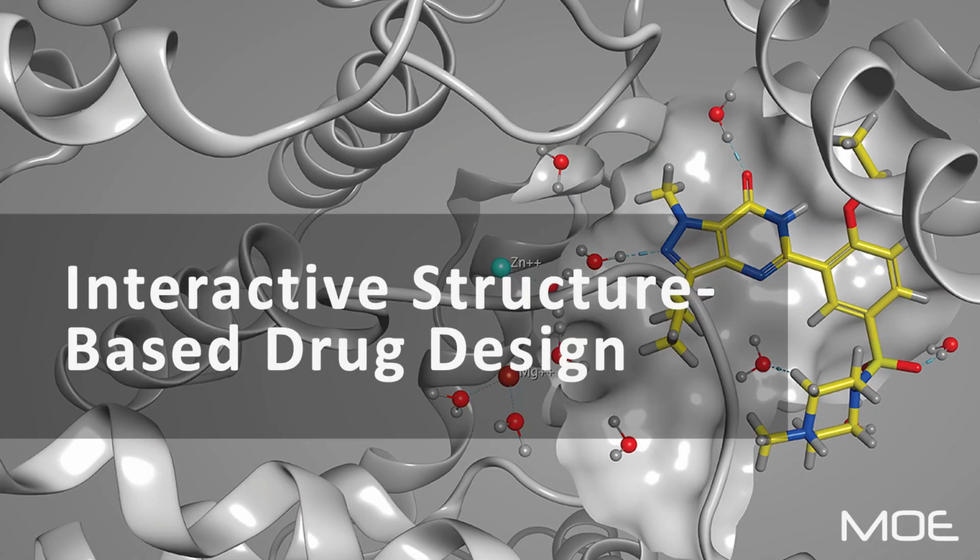Today I'd like to show you how we can analyse a protein-ligand complex. We'll do that by looking at key interactions, steric fit and hotspots, and then I'll show you how we can use that information to design a better inhibitor and improve its properties. So let's get started.